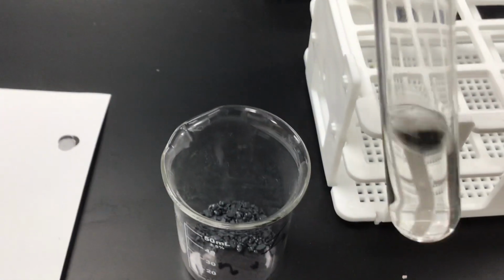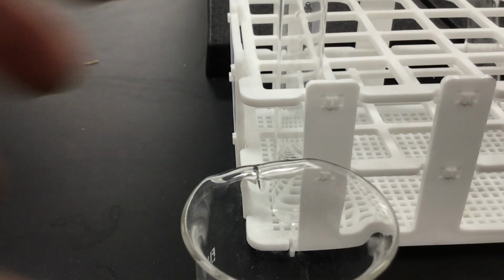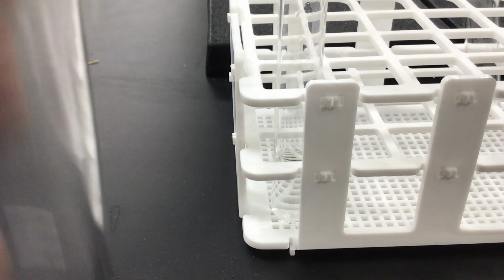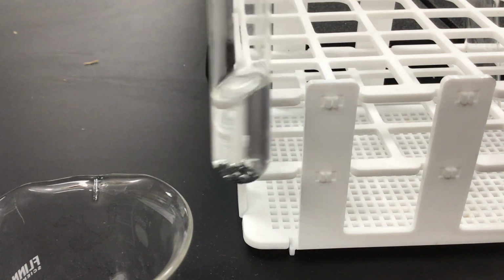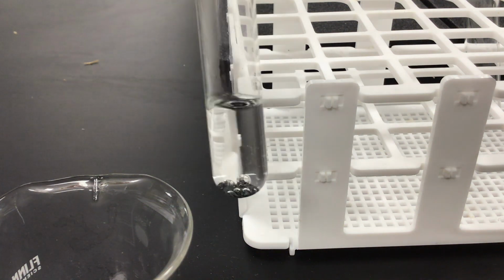So I've got myself a test tube of water, and then I'm going to add just a few tiny crystals of iodine. When I add the crystals of iodine, they just sink to the bottom and nothing happens.